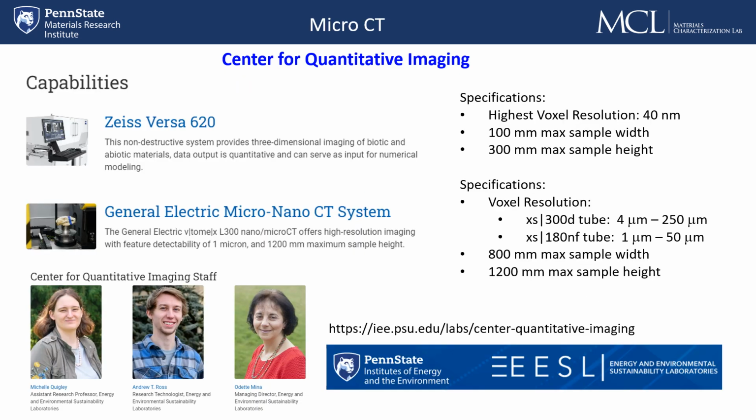At Penn State, we have 2 different MicroCT instruments for doing X-ray tomography, and you can go to the website here for EESL, which is the Energy and Environmental Sustainability Laboratories, which is part of the Institute of Energy and the Environment at Penn State. And you can find out more about the different tools we have there and the people who can answer any questions you might have. I've listed out here some of the specifications for the 2 different instruments, so you can see what resolution each one might provide in terms of your voxels for your 3D volume reconstruction.